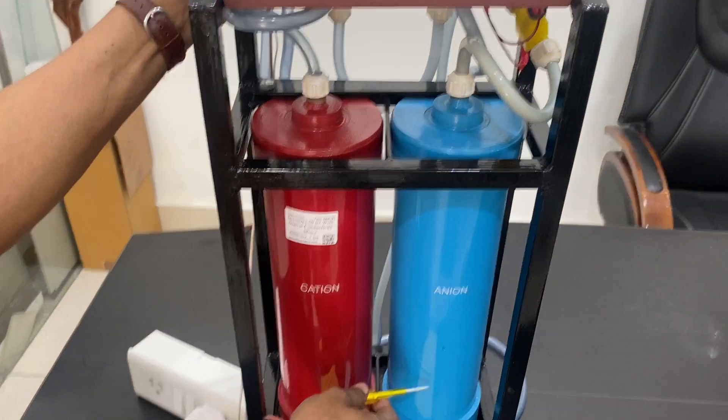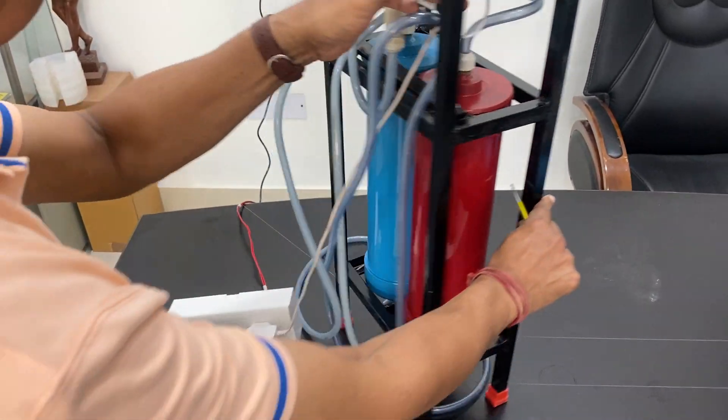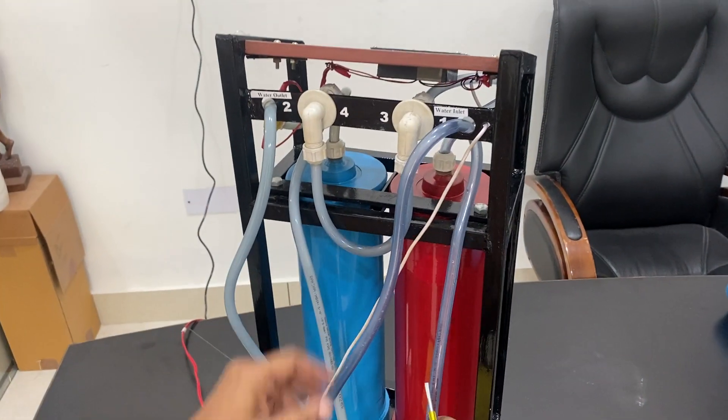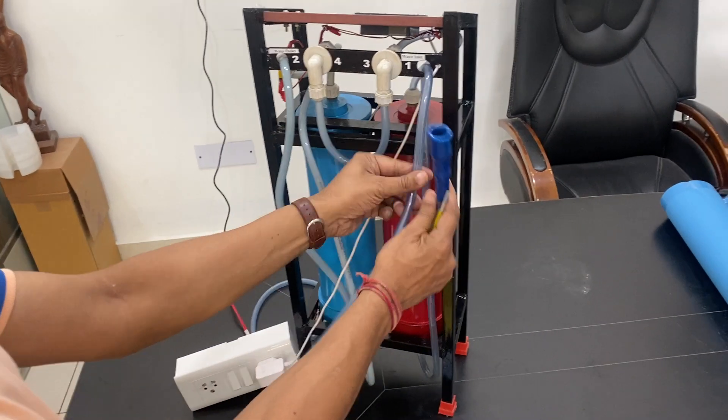There are two chambers. One is the cation chamber for water, which is on the back side. There is a connection — this one tube is for the inlet. You put it on any tap inlet.